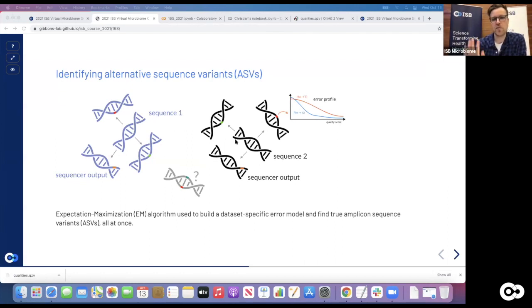You could say, oh, the most abundant unique sequences. Like if one sequence has 1,000 reads that look exactly the same, maybe that was an original sequence of a 16S amplicon. I do that, I estimate the error profile. And then in the next step, I actually assign new original sequences based on that estimated error profile, which is probably wrong, right? Because it's kind of an imperfect argument to make, that those are the original sequences.